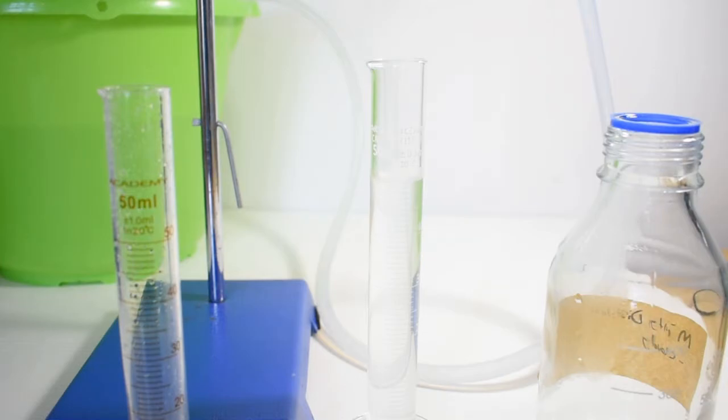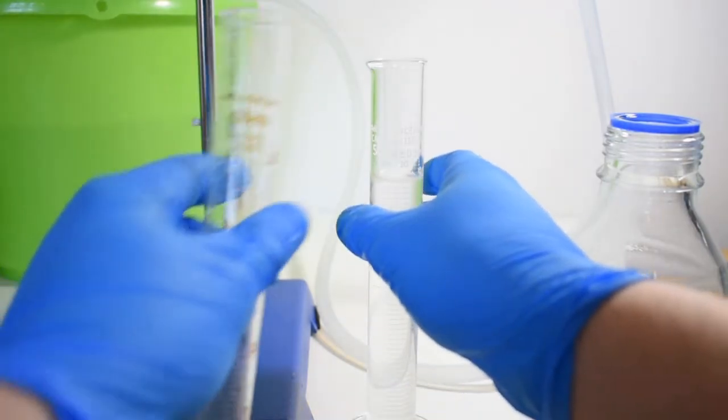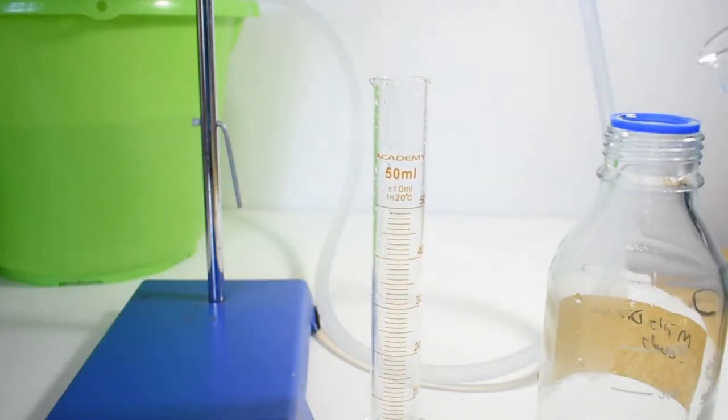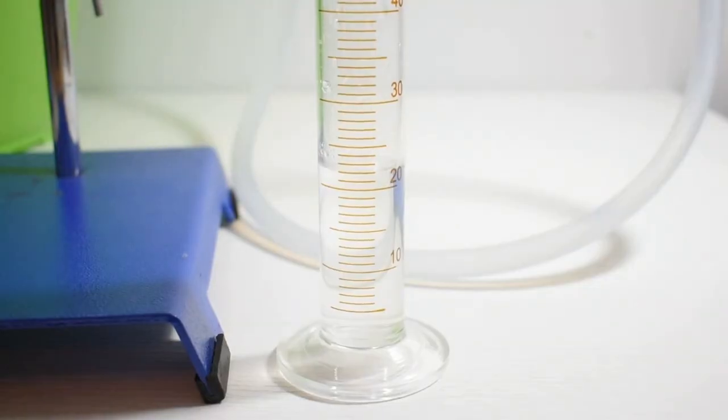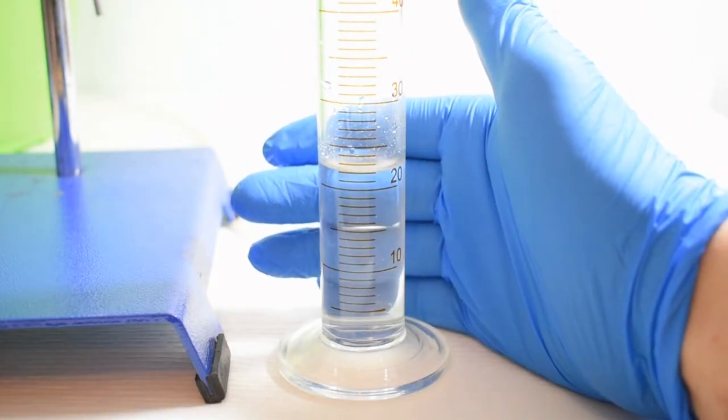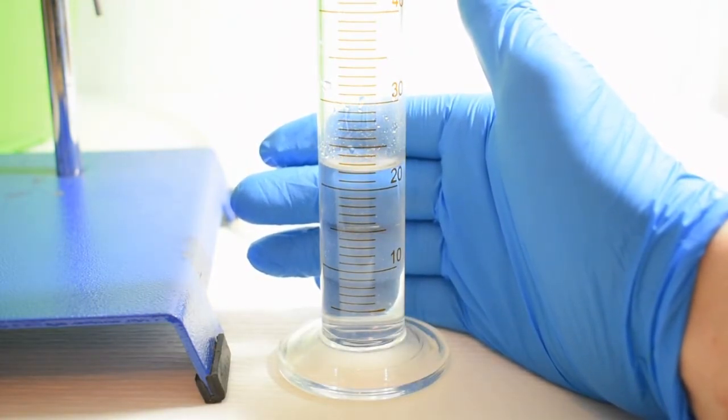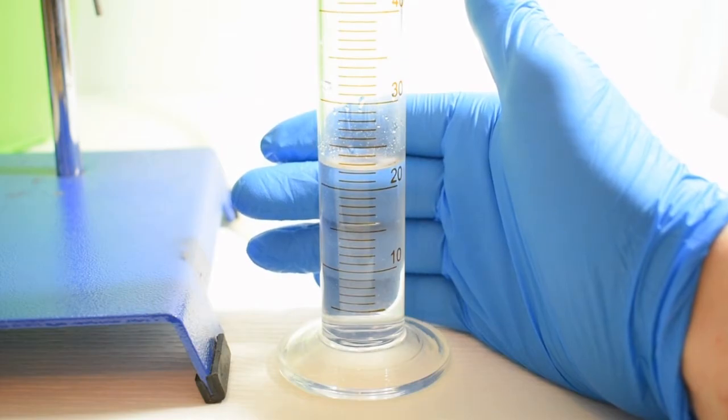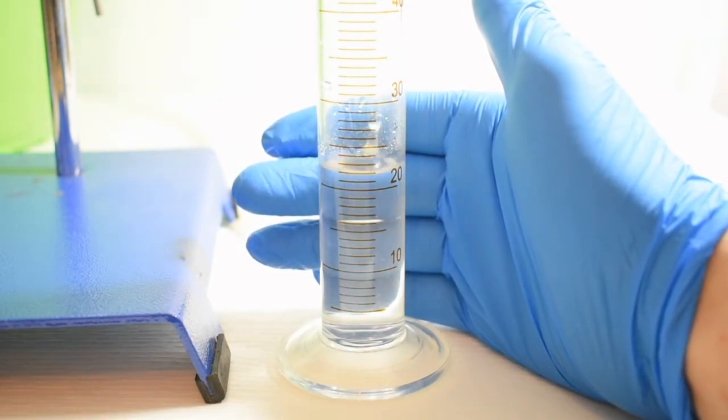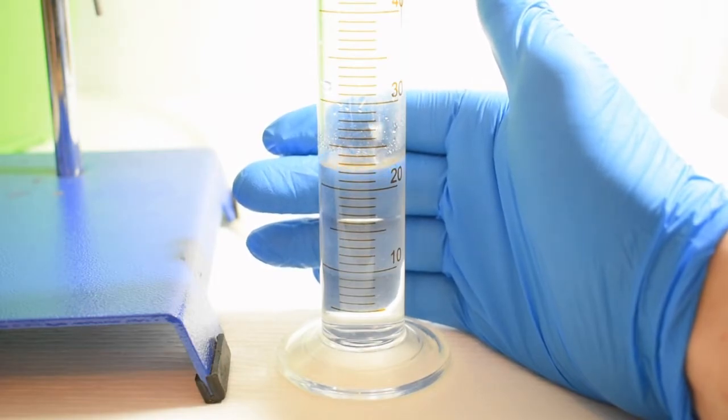Once 50 milliliters of distillate has been collected, the measuring cylinder is swapped out and the distillate is added to a bottle. The second distillate to come over is quite a lot less cloudy, and this indicates the presence of less oil. So I'm going to collect another 50 milliliters and then stop the distillation and refresh the mint in the flask.